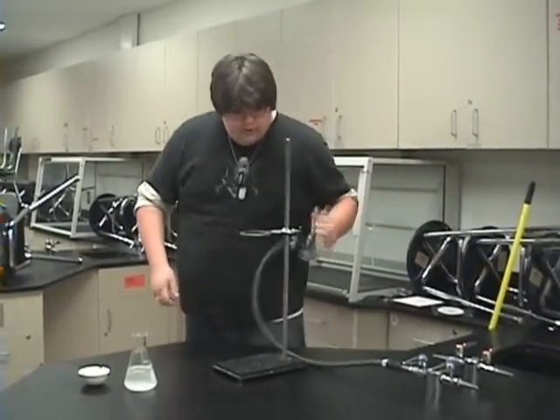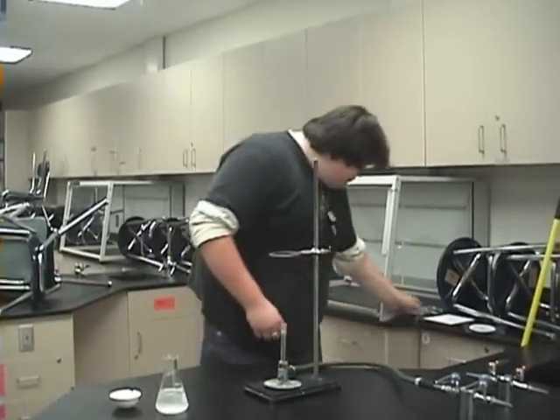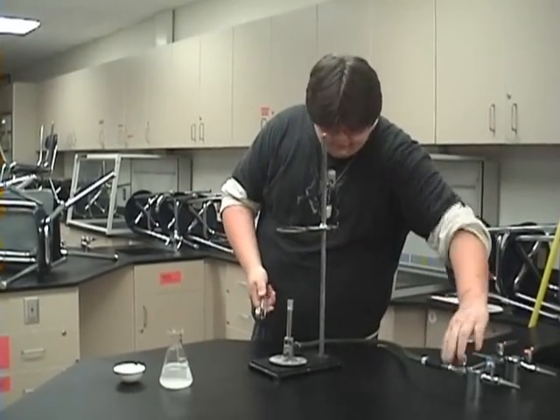Next thing is the Bunsen burner. Once you have the Bunsen burner attached, you put it here. Then take the striker and light the Bunsen burner after the gas is on.